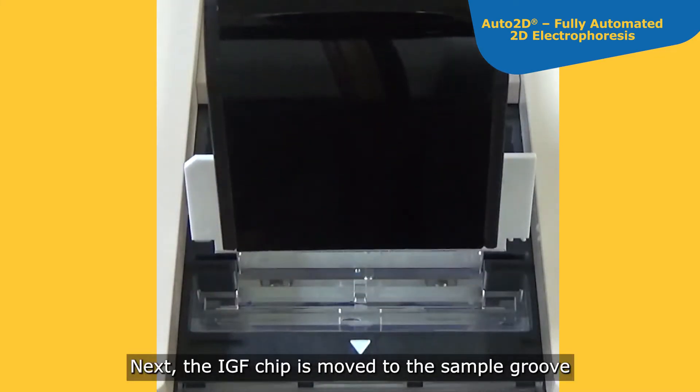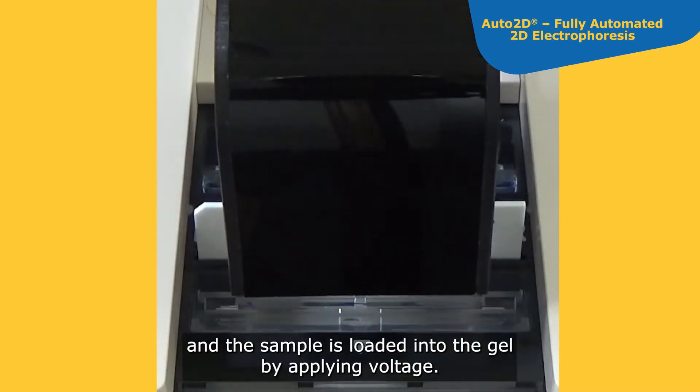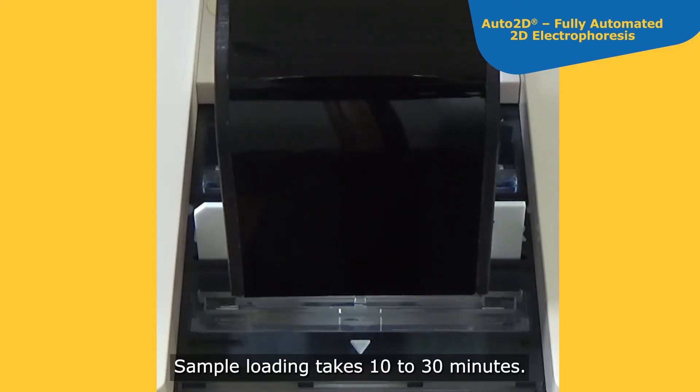Next, the IEF chip is moved to the sample groove and the sample is loaded into the gel by applying voltage. Sample loading takes 10 to 30 minutes.